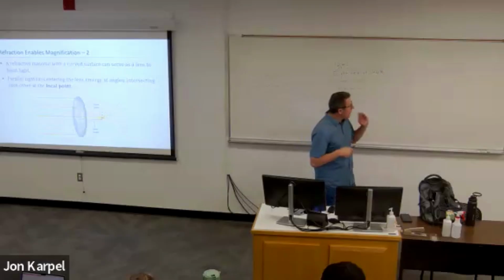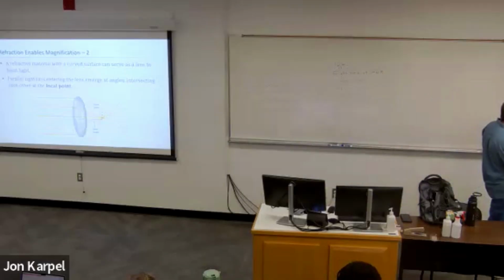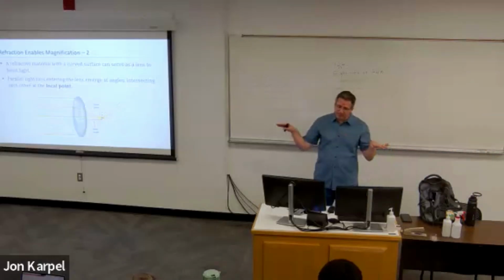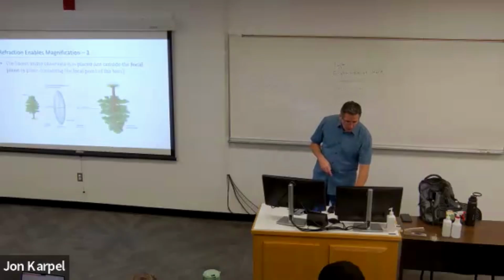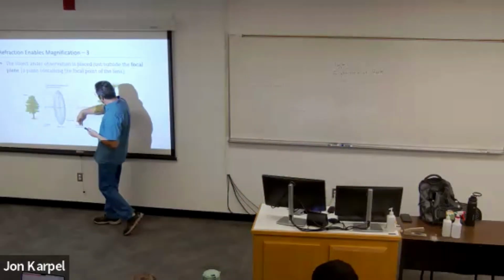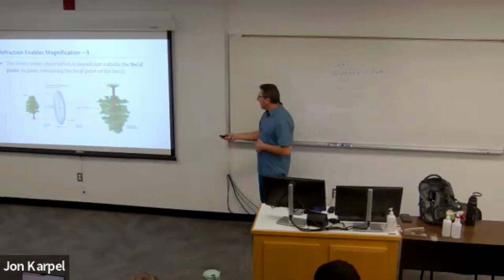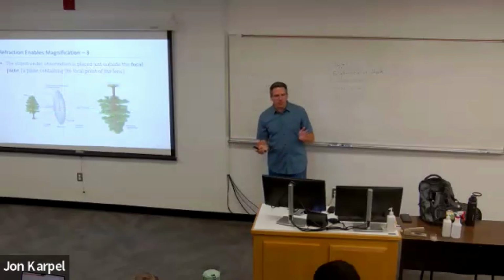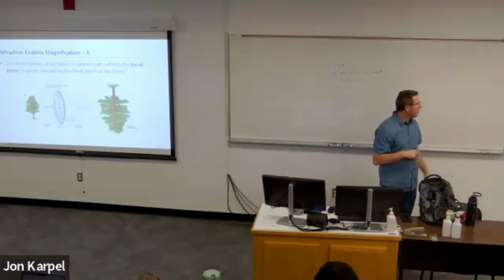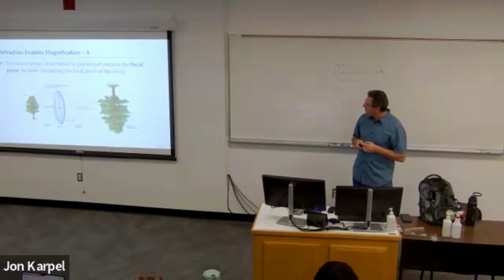So when you take physics, you'll learn about focal points and all that. As light goes through these lenses, there's typically a focal point or focal plane, and we're usually focusing in on the focal points of where the light is actually going to interact. Interestingly enough, when we look at structures under the microscope, they're going to be inverted because of the way the light goes through the lenses.